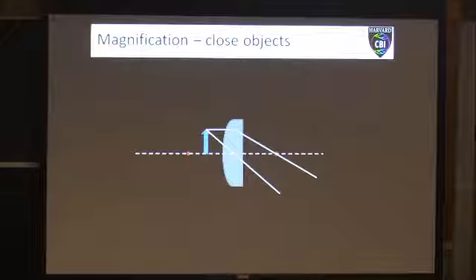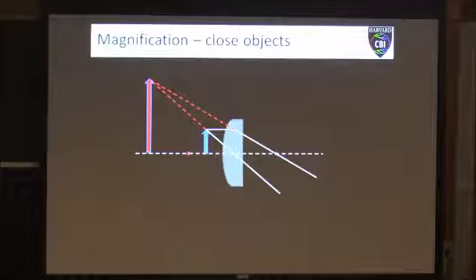So what we have here is a situation where we don't have what's known as a real image formed. We have a virtual image formed. And what we're actually going to do is we're still looking for the place where these 2 rays intersect. But instead of being on this side of the lens, those 2 intersect back over here, right? So if I extend those back this way, we get an intersection up here. And now you can see our object is dramatically magnified compared to the original.